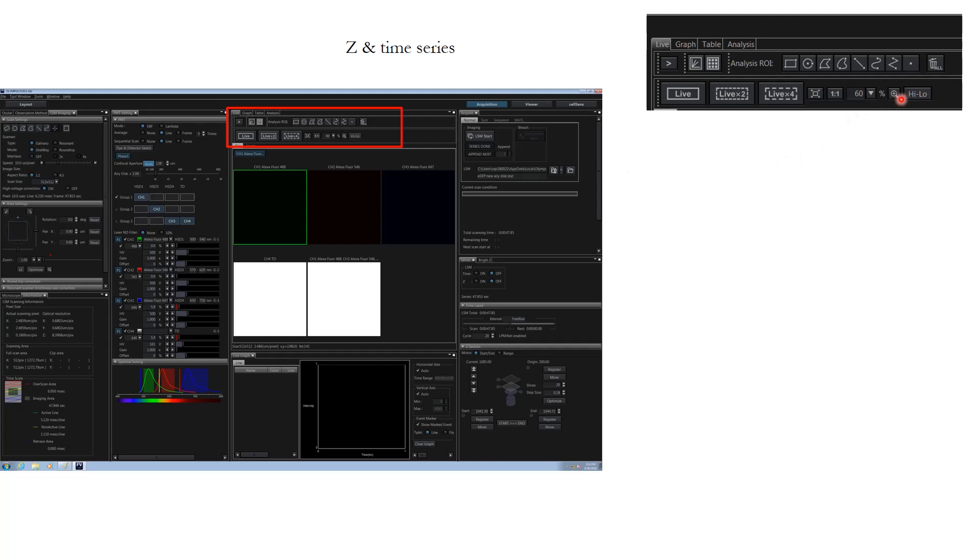If you click high low, you will be able to see all the pixels which are zero in signal highlighted as blue in color. Accordingly you can adjust the offset parameter so that you can have a nice zero background.